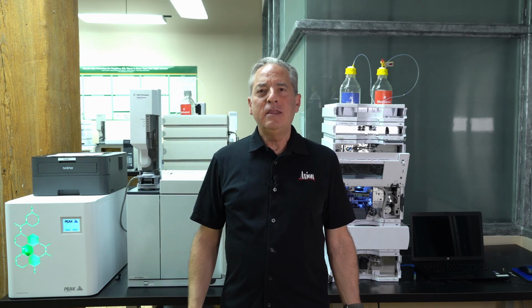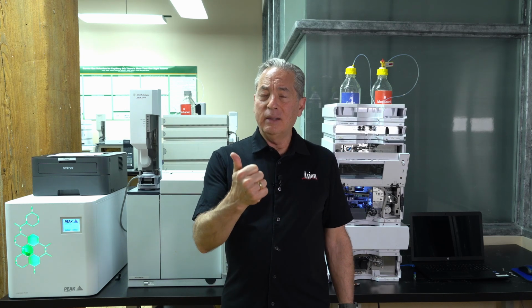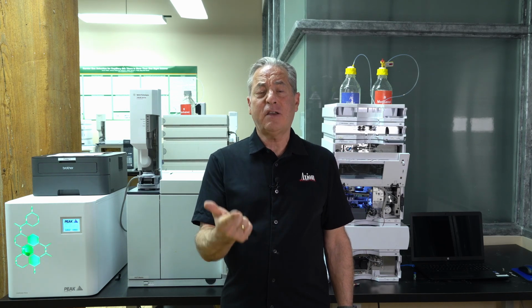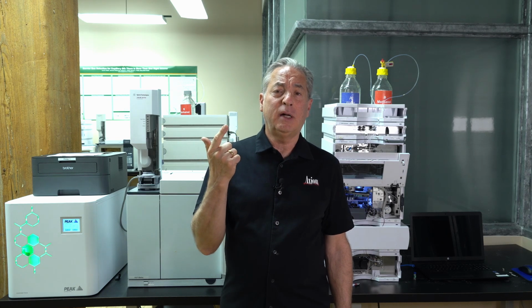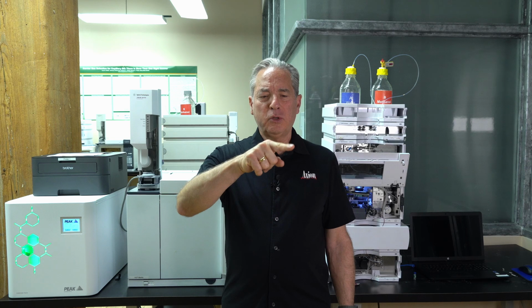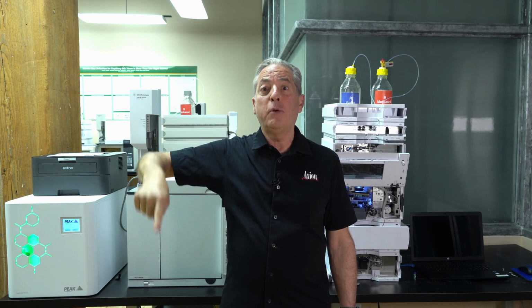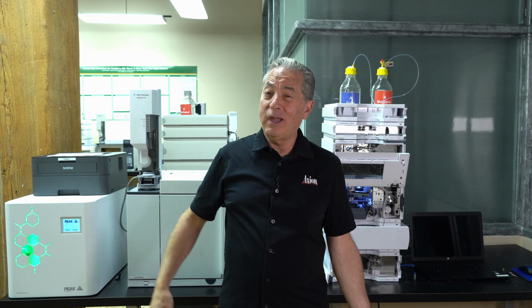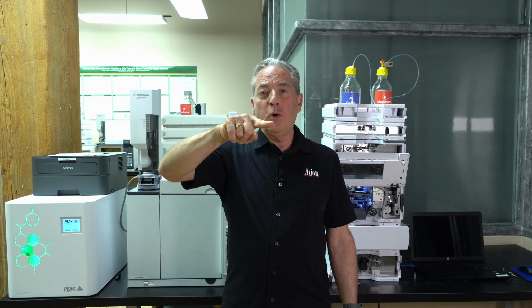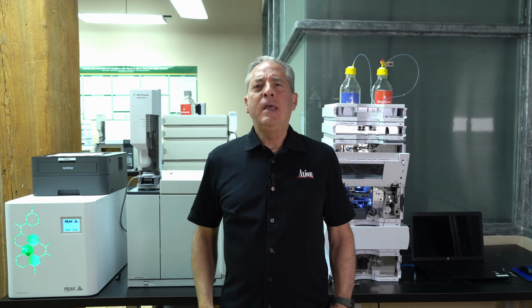That tells me the pump is working properly, because things that go wrong with the pump, a leaky pump seal, a leaky check valve, a bad fitting, all those will result in a pressure fluctuation. So if your pressure is fluctuating, then we go look for a problem, most likely an air bubble in the pump. If we don't have any fluctuation, then we say, hey, my pump is working well.